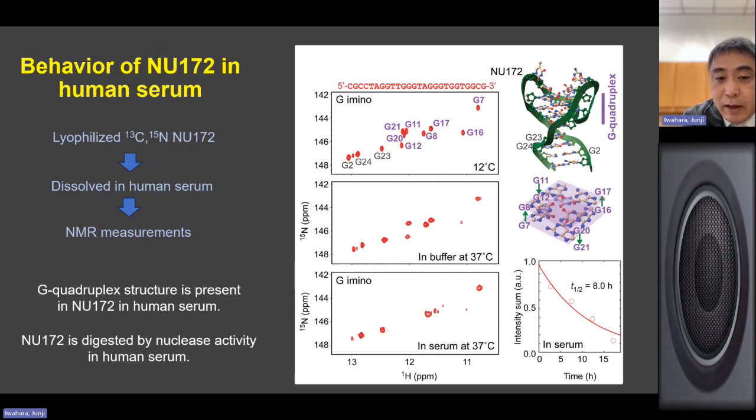That's quite interesting. But we should also mention that the G-quadruplex state is not 100% at physiological environment. Actually, when we measured carbon-13 HSQC, we saw multiple species, and probably the G-quadruplex state is about 50% at 37 degrees. And we even observed exchange cross peaks in these exchange experiments, and we got kinetic information. We haven't published it yet, but we will do it soon.